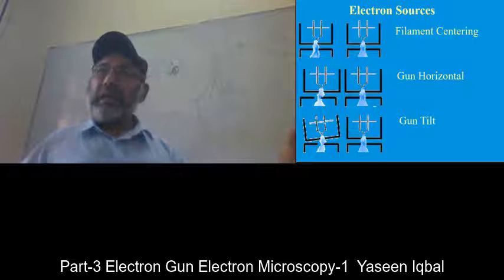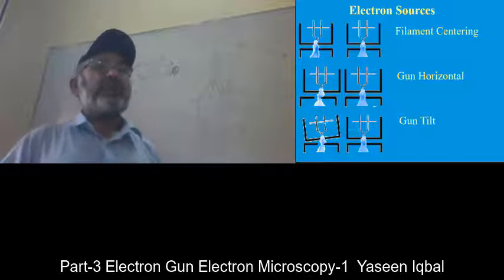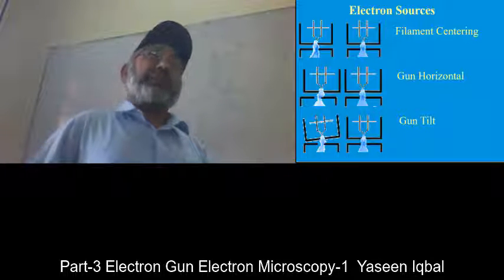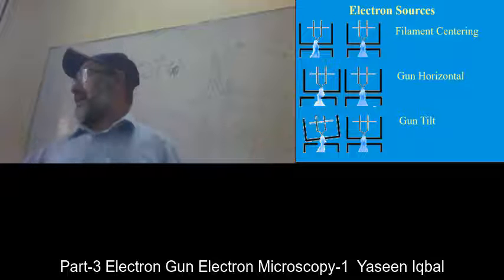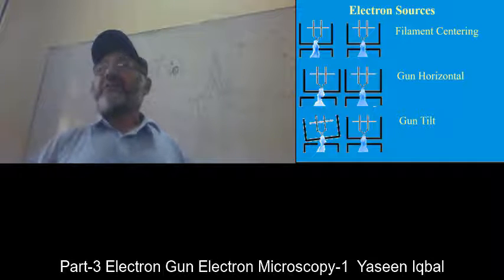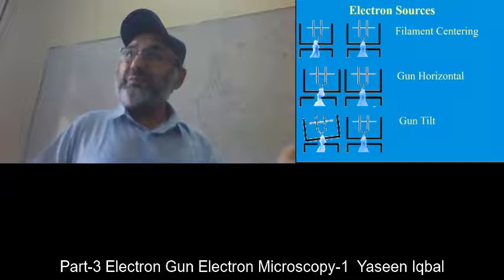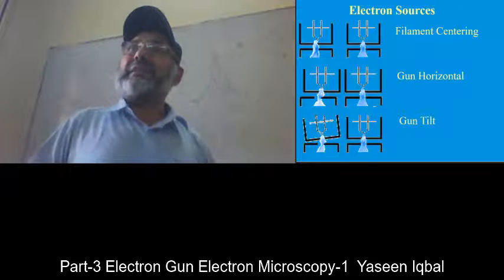So the environment in which the microscope is placed also counts towards the quality of the machine. If the environment has no stability of the field around, a current passing in a wire there is enough for the electron to disrupt its path. Electron is a very fine thing.